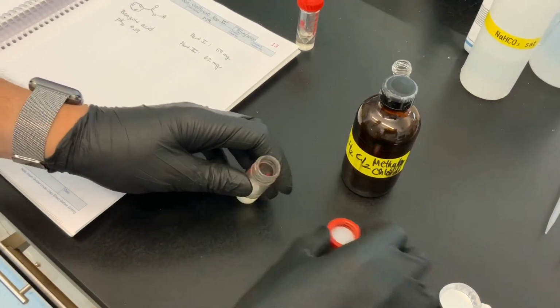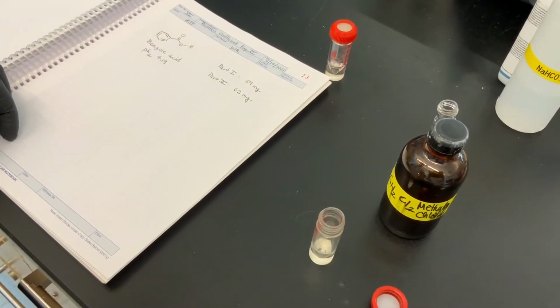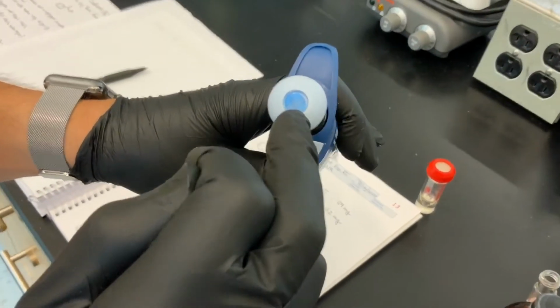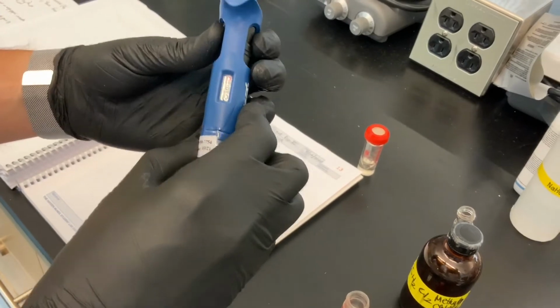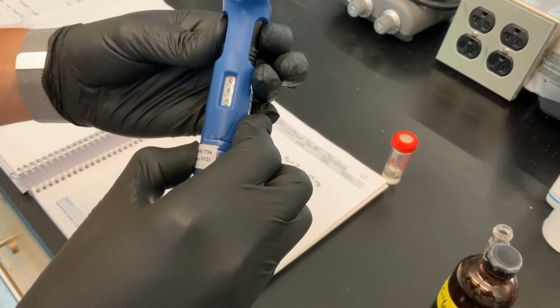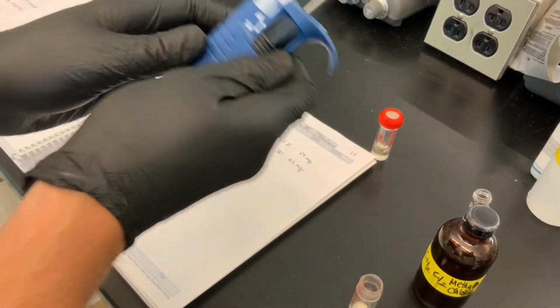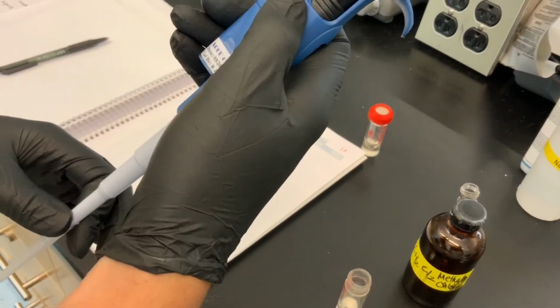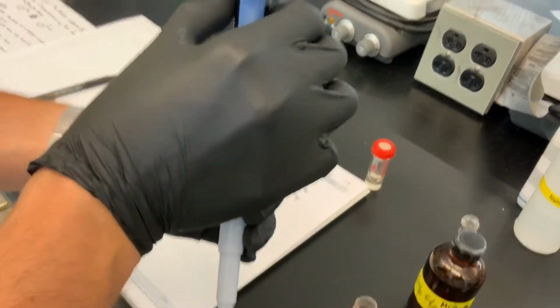We are going to dissolve the benzoic acid in methylene chloride, and we are going to use 600 microliters. So we get out our 100 to 1000 microliter auto pipetter, and right now it's at 800, so we're going to dial it back to 600 microliters, okay? And now you can even lock it in place if you wanted to. Or actually, no, that's not the lock. That pushes out the pipette tip. This is the lock. Upward there, and now you can see I can't turn it anymore.